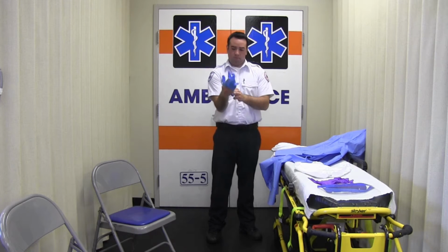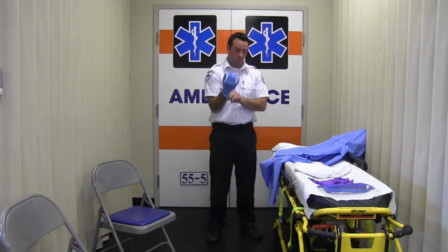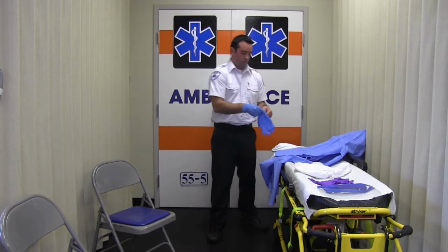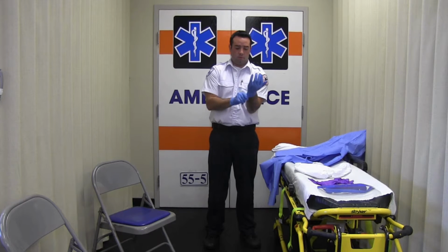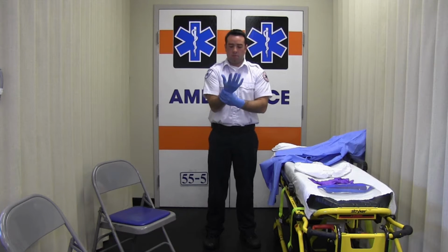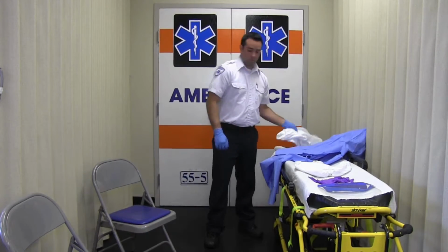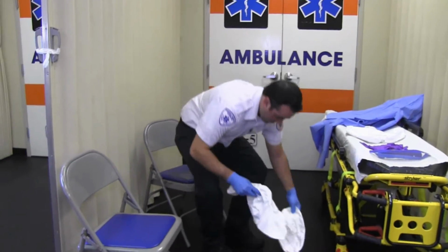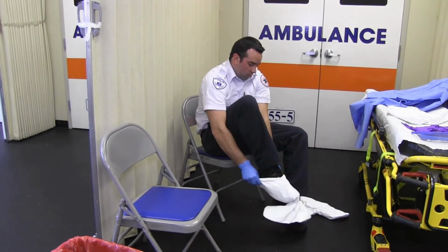Now you will put on your first pair of gloves, which we will refer to as your inner gloves. These gloves may be regular or extended cuffs. Once your gloves are on, you'll put on your boot covers. You may need to take a seat to do this safely. The boot cover should extend to the mid-calf and preferably have a non-slip sole.